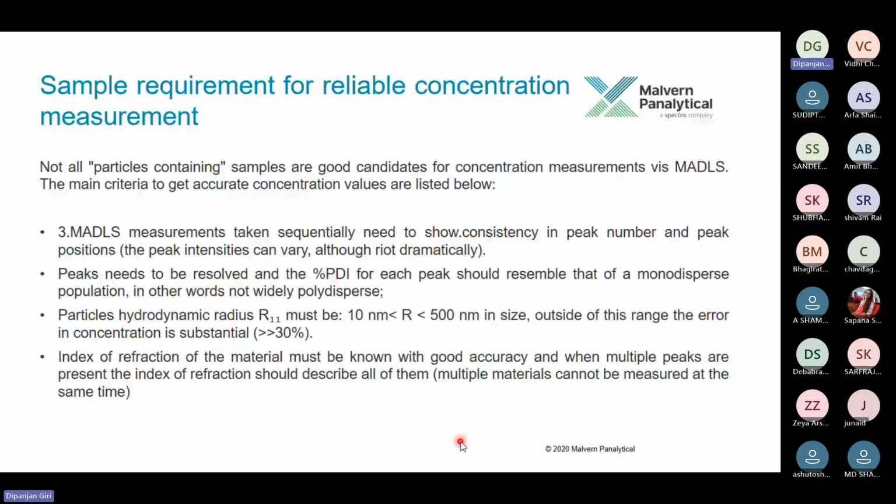Usually there are limitations, but you have another technique, NTA, nanoparticle tracking analysis. From there you can get very good quality data on the concentration of particles.